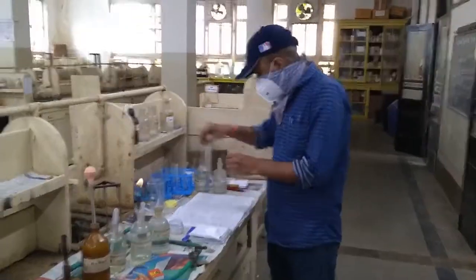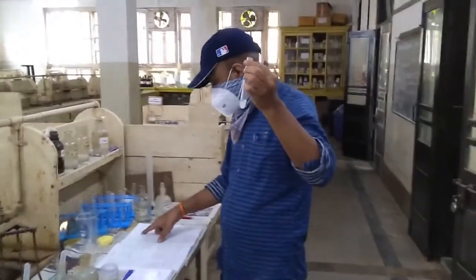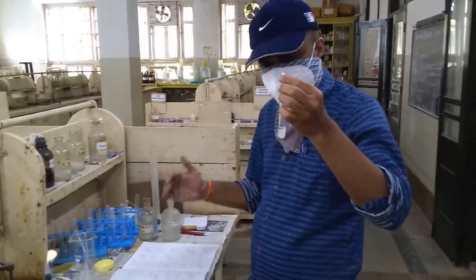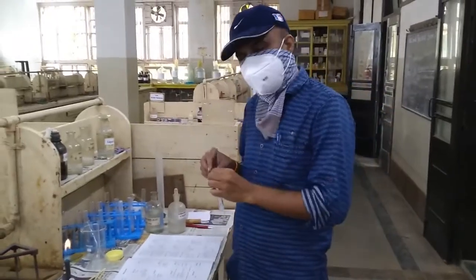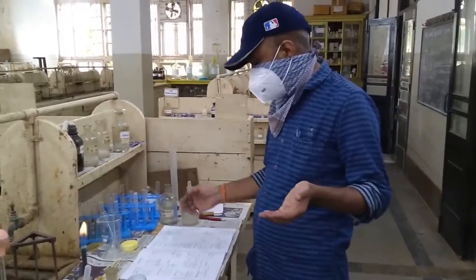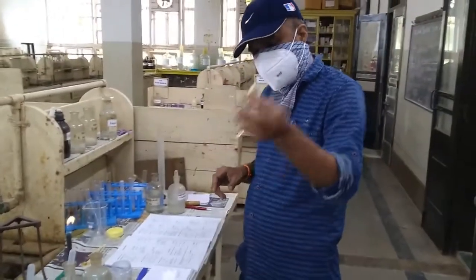Now we will do the analysis part of group 3A. The precipitate color for group 3A is a white gelatinous precipitate. So Al3 plus is present. After Al3 plus is present, let us see the confirmatory test for Al3 plus. The first confirmatory test for Al3 plus is original solution plus NaOH, which gives a white precipitate which is soluble in excess. Let us see the confirmatory test, this is OS.